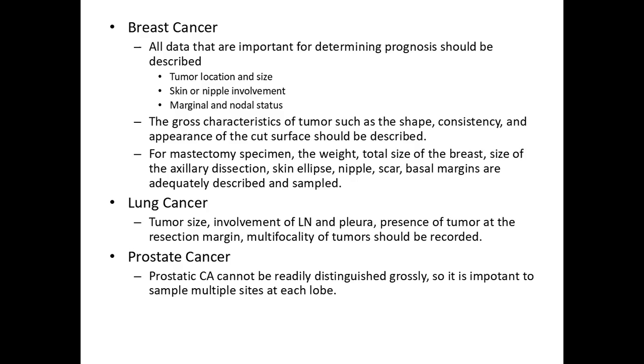Basically, the lymph node is very important, no? Kasi ginagamit yan, no? Yung pinaka-lymph vessel natin by the cancerous cells to metastasize. So pag ang pathologist nagpo-perform ng gross, isa sa mga hinahanap niya yung lymph node. Kukuha siya ng sample niya. Kasi kung ang cancerous cell nasa lymph node, so it is a sign of metastasis, meaning kumakalat na siya.